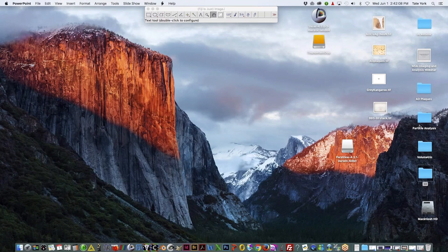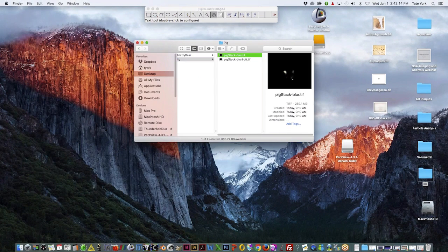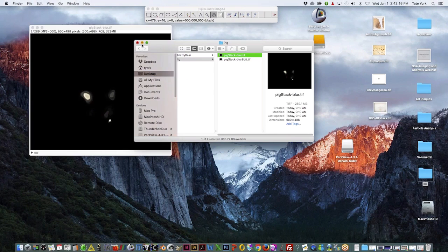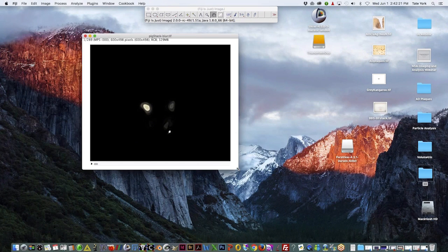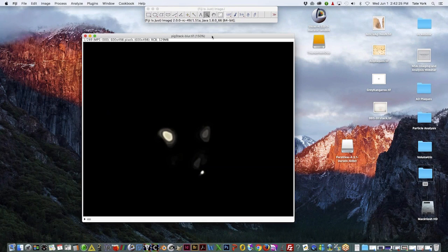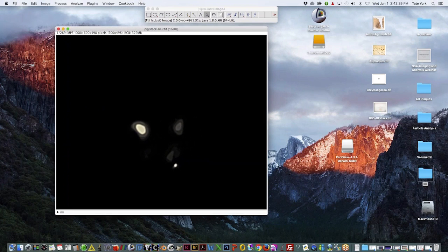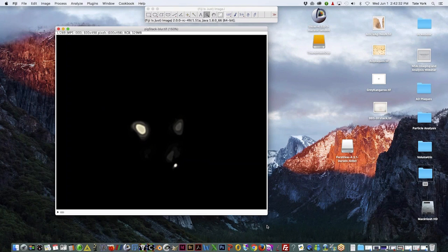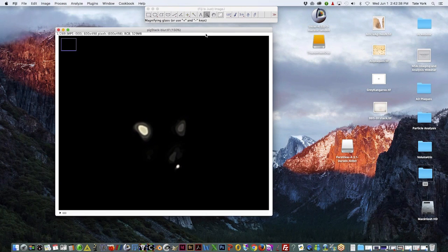So let's see what this looks like in the 3D viewer. So we get a nice volume reconstruction here with the block face image combined with the thionin set. Gives you nice detail, nice smooth surface. And just like with the others, you can upload this to Volume Viewer and look at it in a number of different planes.